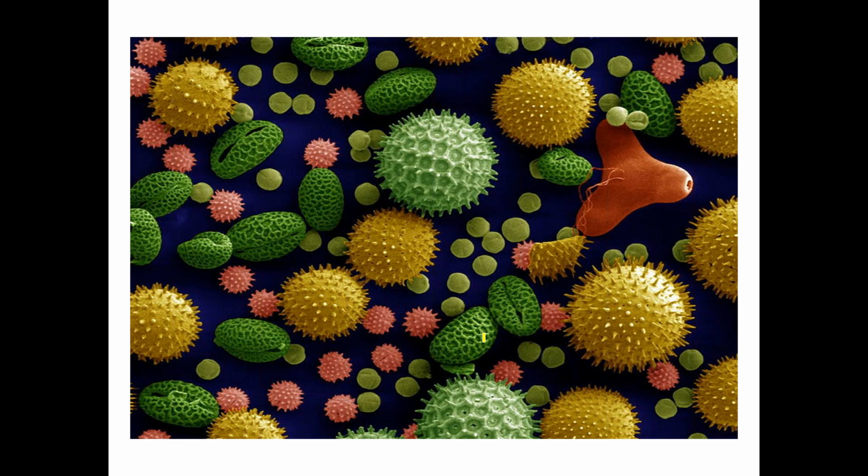You can see round bold structures with spikes. You can see some oval structures with some pores. You can see some round structures. It's like morphology, arrangement, everything. It will all come together.